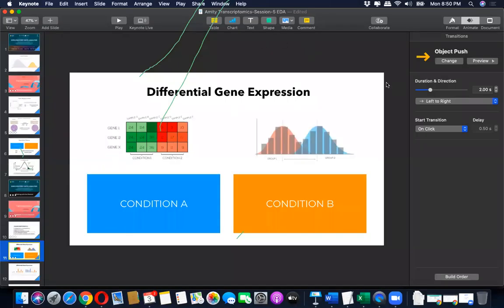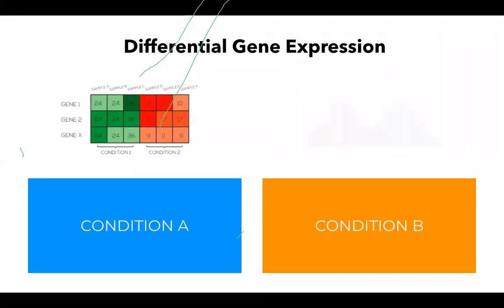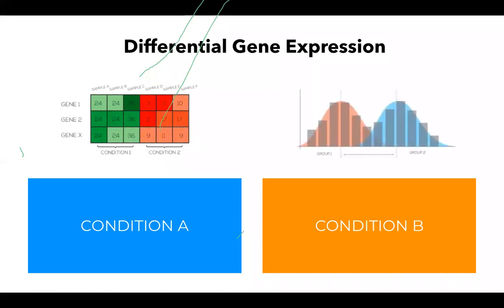So sorry about that. If you see the histogram here in this image, you will see each group of the samples and the difference between group means. This represents a difference in expression that you can observe between two different groups, and there is a mean associated with it. So the conclusion of this analysis is biological interpretation. How can these differentially expressed genes show biological difference between conditions that we study?